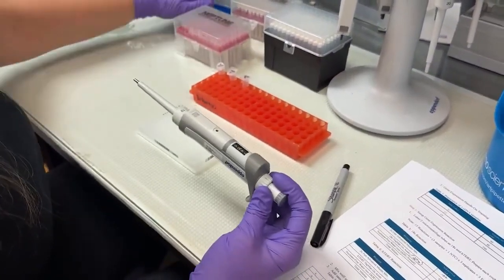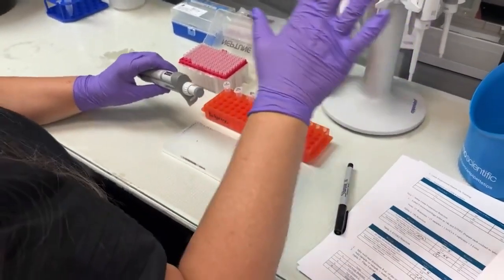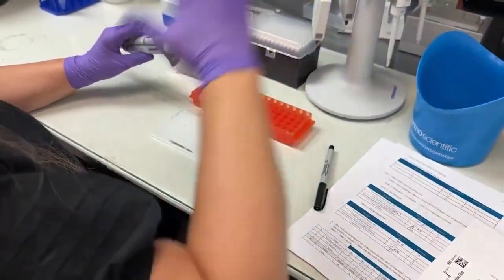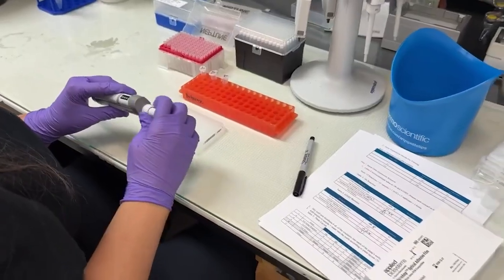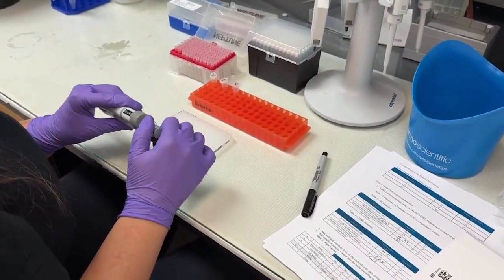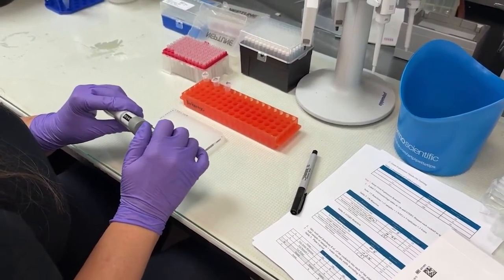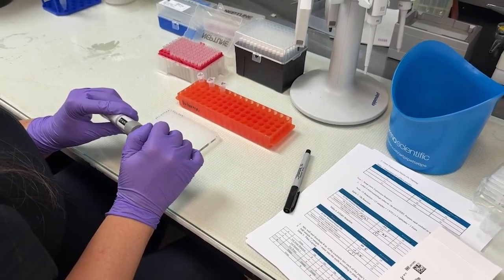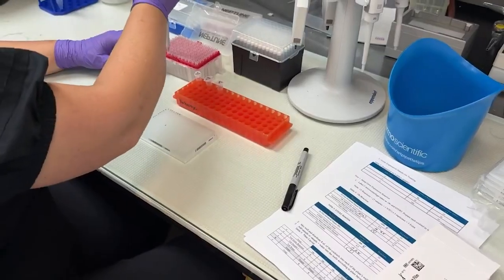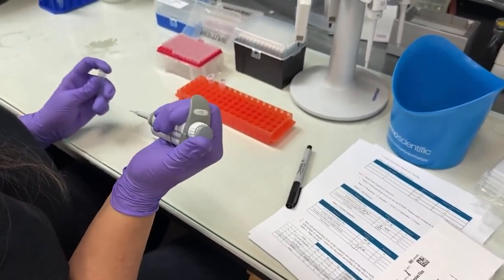It's nice to have your workspace organized and easy to use. I like my tips and my waste container on my right because I'm right-handed. So think ahead about how you're going to be working in this space and the things you need before you start. To each reaction, I'm going to add 2 microliters of sample. I have 3 samples labeled sample 1, I know, creative, sample 2, and sample 3, and then I'm going to add a no template control.